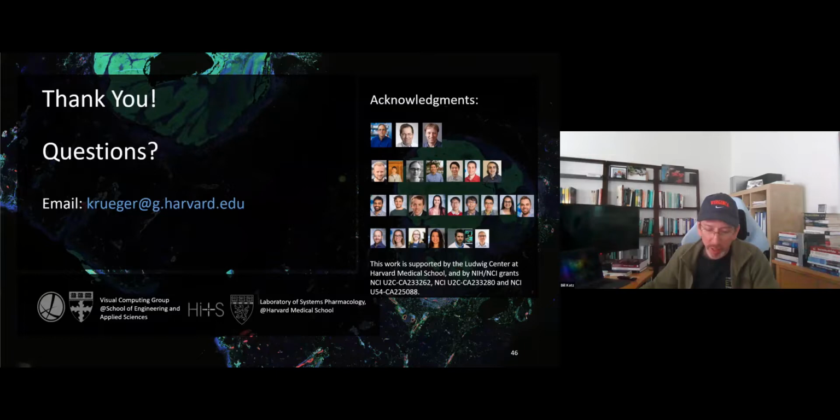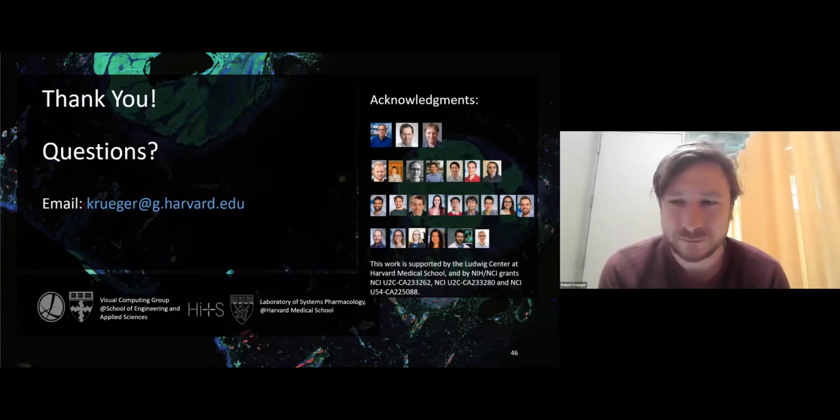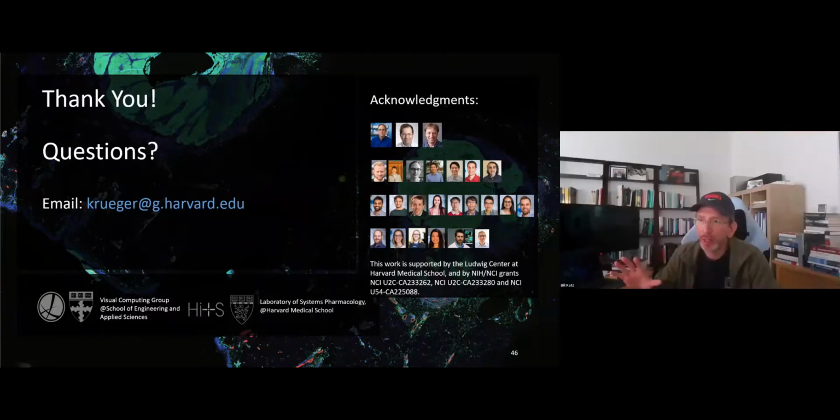So I guess I'll ask a couple here. Going back to the ability to change the pseudo-coloring of your visualizations, I think it's Scope2Screen, I'm wondering about research in terms of manual versus auto-optimized ways of representing the color scheme and the various other things.